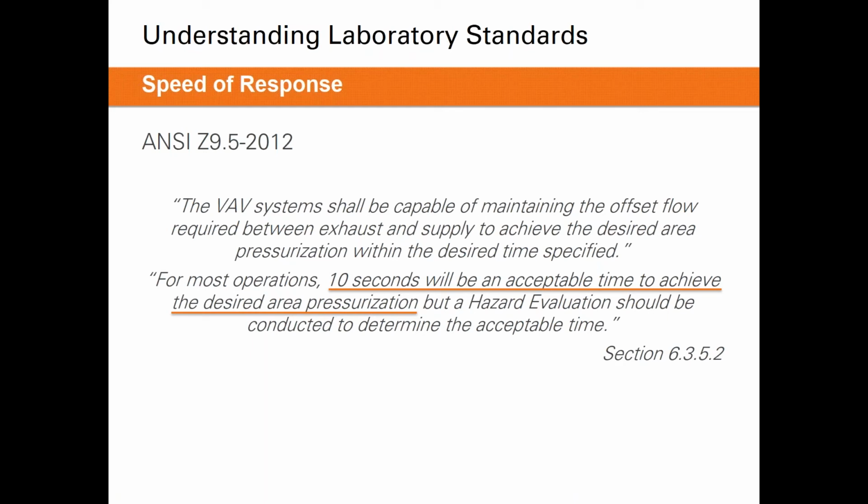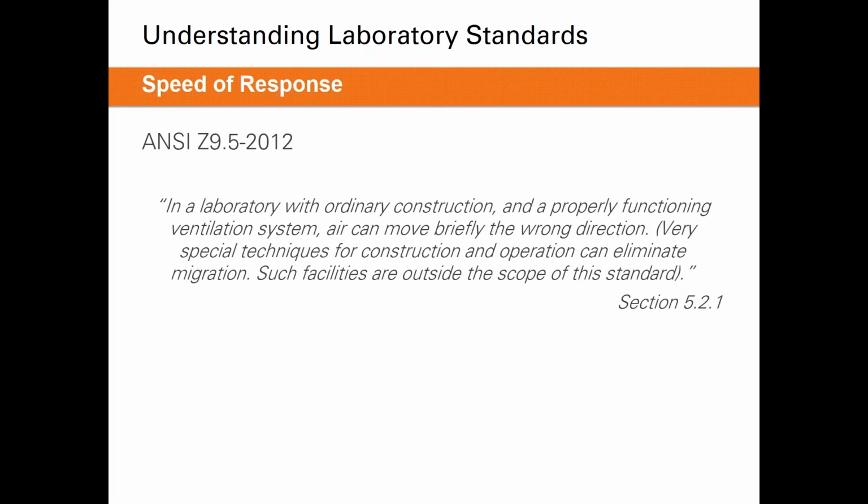So similar to our air change requirements, ANSI Z9.5 here states that while 10 seconds may be acceptable for most areas, a hazard evaluation and understanding what's going to be in the room is important so that it can be defined ahead of time what response time is required for the space. So the speed of response that's required for the room should be dictated by the engineer in the project documents.